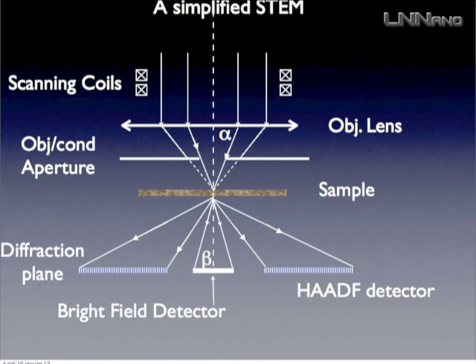Anyway, the basic idea is that you just need an objective lens, and somewhere very far from this objective lens, maybe 2 simple detectors, and that's it. Of course you need a sample, otherwise you won't do a lot, but essentially you just need an objective lens, some detectors, and a sample in between.